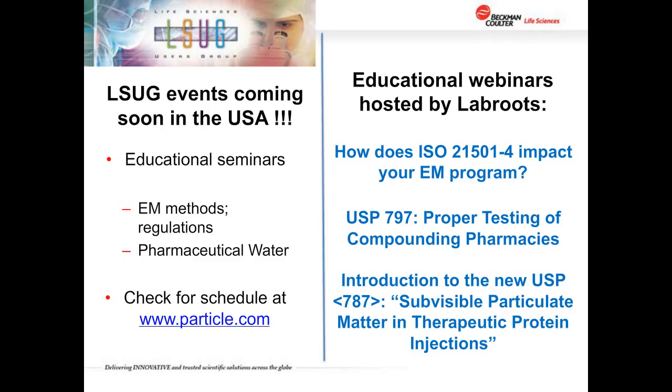But truthfully, I think a better title is total, in that anything that's in the air, be it living or not living, or be it viable, that is able to reproduce or not, to the particle counter and to the table is not significant. In other words, a particle counter sees an organism or a skin flake with a bunch of organisms on it as a particular solid entity in the air.